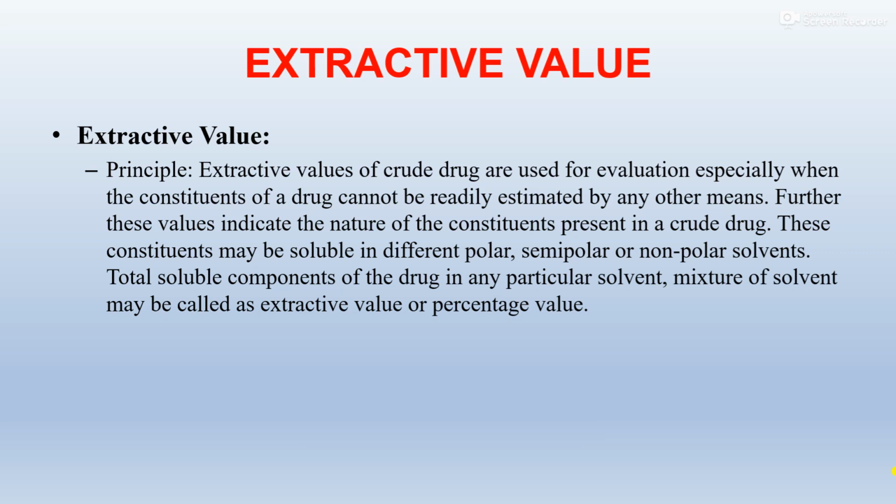What is the principle involved in extractive value? Extractive values of crude drug are used for evaluation, especially when the constituents of the drug cannot be readily estimated by any other means. Further, these values indicate the nature of the constituents present in a drug. These constituents may be soluble in different polar, semipolar, or non-polar solvents. So, total soluble components of the drug in any particular solvent or mixture of solvent may be called as extractive value or percentage value. So we will perform the two types of extractive value.